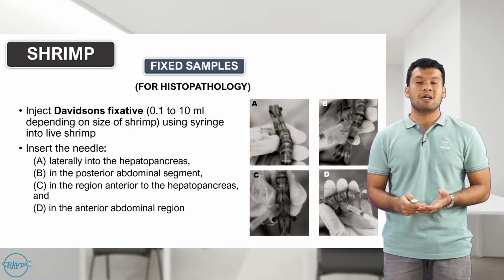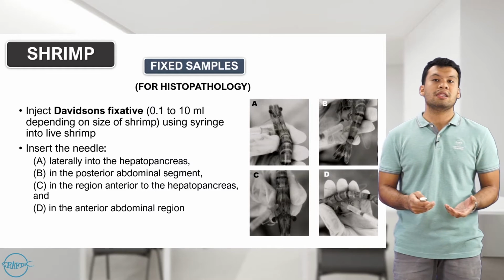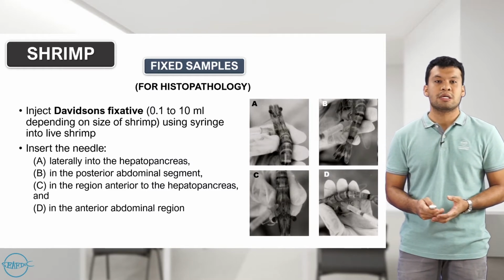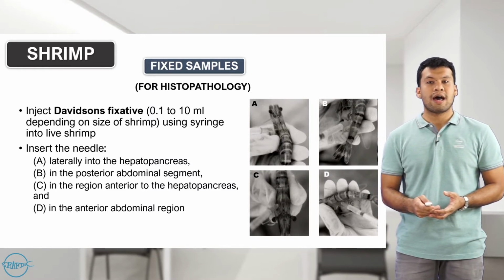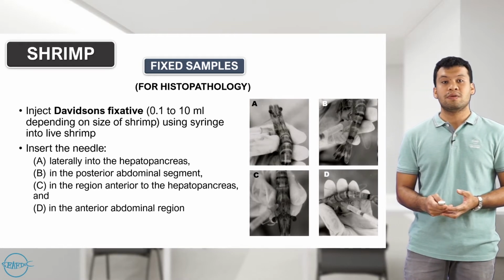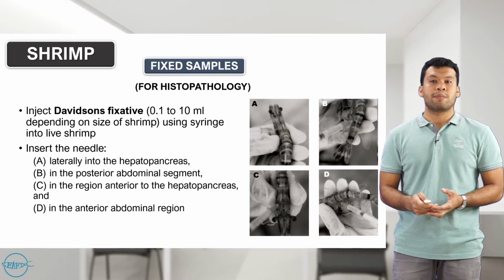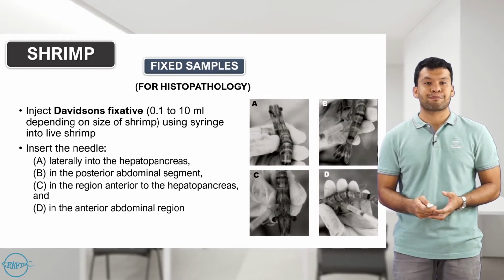Since it's very hard for the fixative to penetrate within the inner parts of the tissues. It is more the case if we have, for example, larger fish or larger tissues, where it's really hard for the fixative to penetrate within the inner parts of the sample.